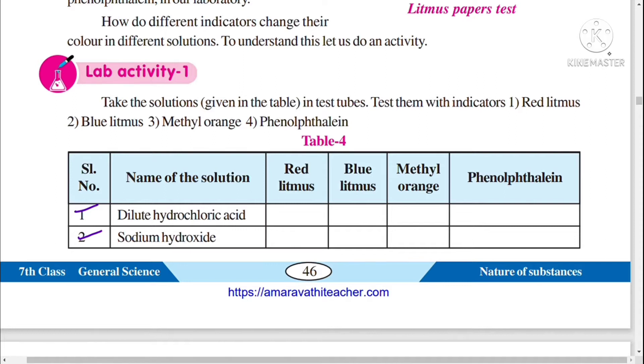We will test these solutions with the indicators. We have 4 indicators: red litmus, blue litmus, methyl orange, and phenolphthalein.